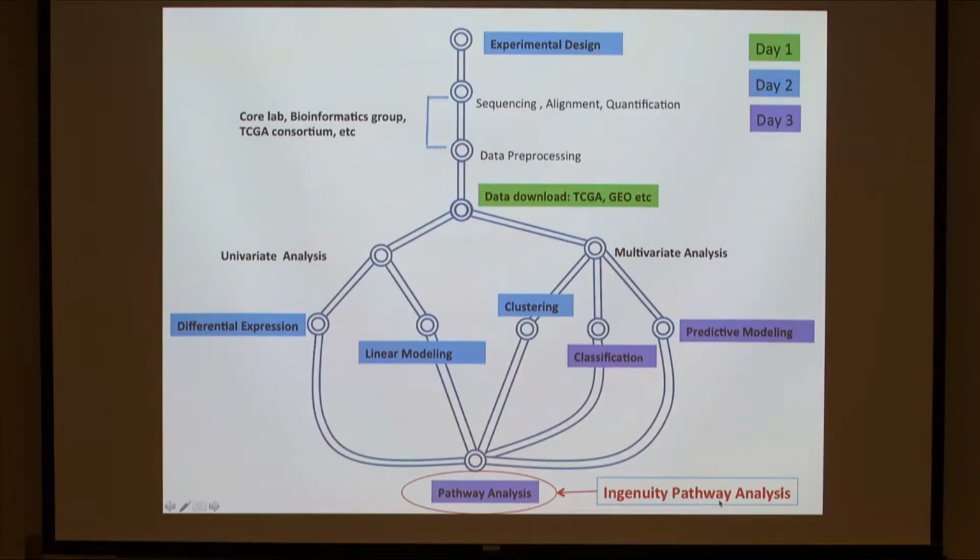Usually you can see thousands of genes upregulated or downregulated. There are many methods to summarize the results you have. One useful tool is Ingenuity Pathway Analysis. It tells you which pathways or networks are involved or regulated in your data set.